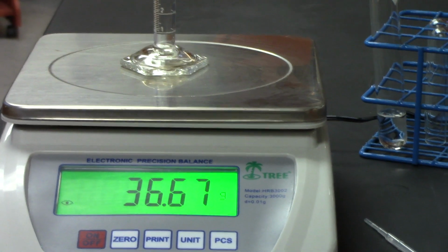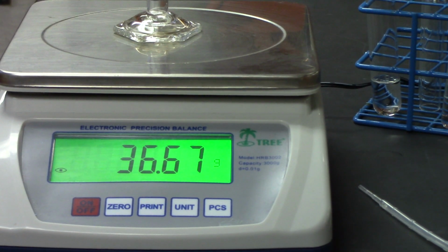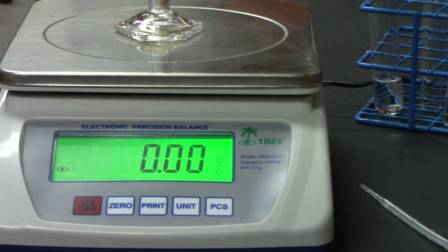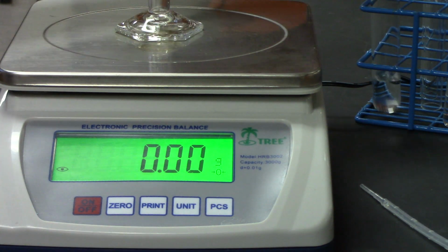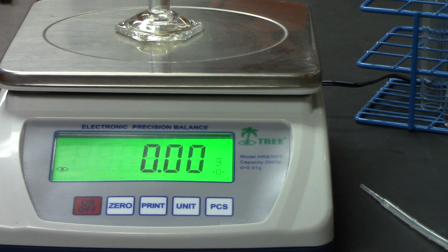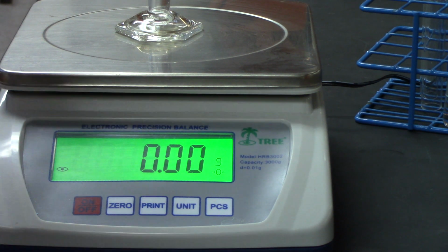And to do that, we have a button here called 0, which gets rid of the mass of the graduated cylinder. Okay, so what I'm going to do now is take some of my unknown and add it to the graduated cylinder, and I'm going to record its mass and its volume. And it doesn't matter how much I put in the graduated cylinder.